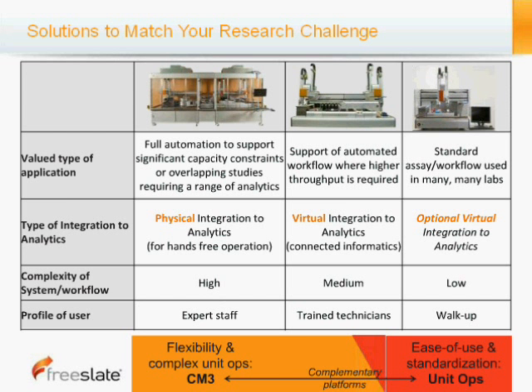The third type of workflow we have, which are the ones that we'll be talking about today, are workstation-based workflows. And these workflows are easy to use and really are designed to address specific assays used in many labs on a day-to-day basis. For those, you can purchase virtual integration of the analytics, which is optional. Usually the complexity of the workflow is low, and those workflows are walk-up type instrumentation.